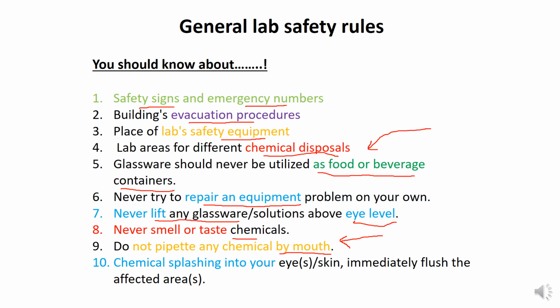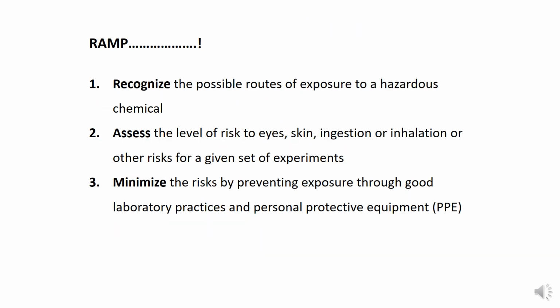If chemicals splash into your eyes, of course, immediately wash using the eyewashers, clean the affected areas, and use first aid. This is a normal procedure: you wash your eyes for about 20 minutes. Wash your eyes if there is a spillage into your eyes, and of course, this is serious stuff with the eyes, so definitely discuss with the doctor.